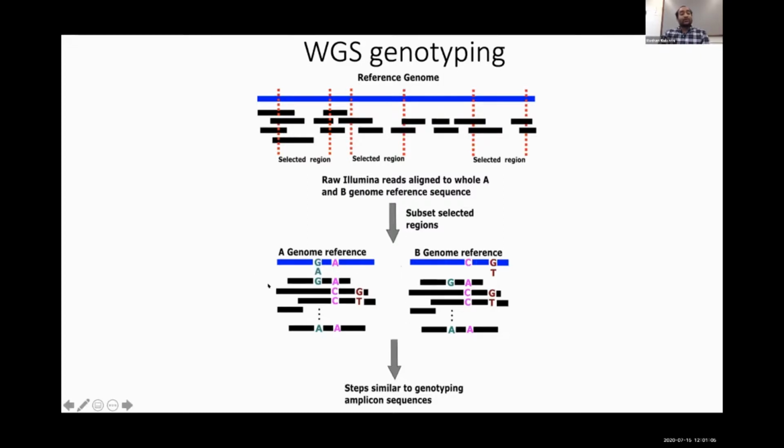Apart from two notable differences: if you noted my previous slide, for all the reads, the start site and the end site were the same. That's because it was amplicon sequencing. Now, since we're breaking it in the middle of the whole genome, the start and end sites are different. So that's the modification in the code when we deal with whole genome. And also the read depth when you have whole genome sequencing is really low, so you most often need no paralogous filter.